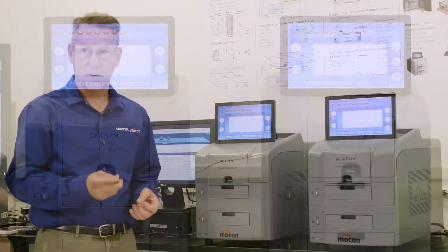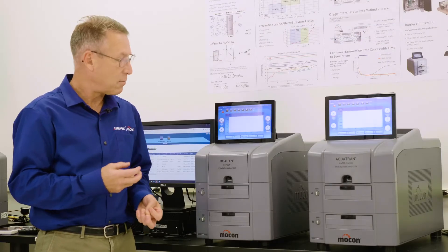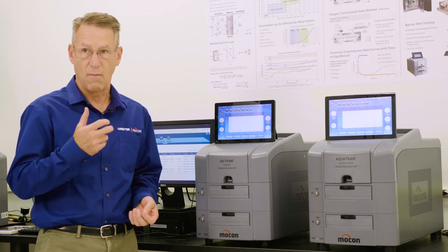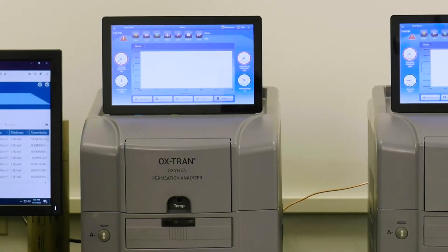Additionally, these instruments have a parallel conditioning mode that, combined with our fast response Kulak sensor, allows them to get more testing done than our older instruments.